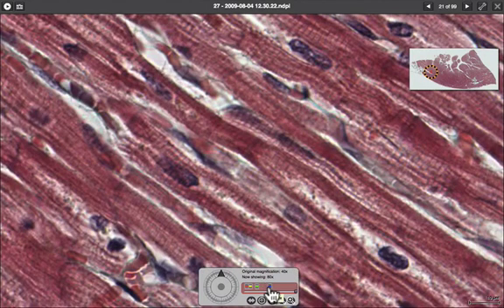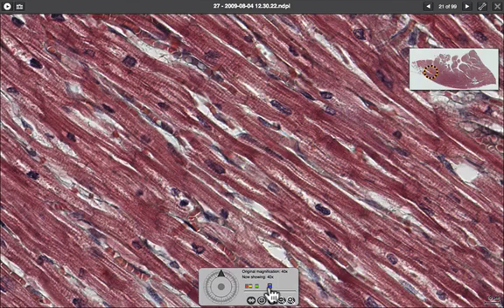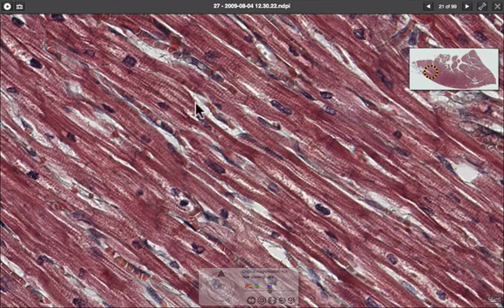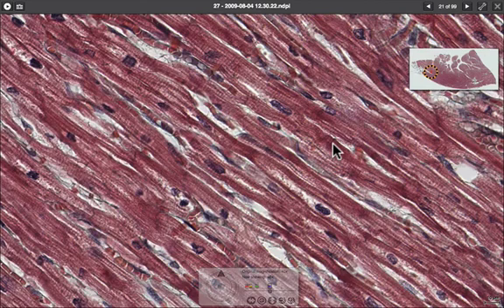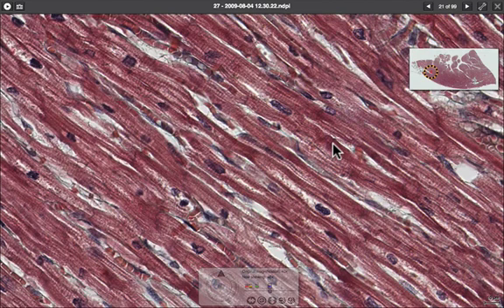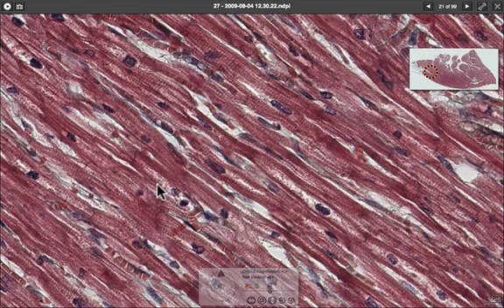The third distinguishing feature is that the muscle fibers branch. We can see this fiber branching from this one, and here's another fiber branching into two. The reason for this is that the heart needs to contract the whole organ, so it needs fibers branching in all different directions to contract the whole structure rather than just a small part of it.